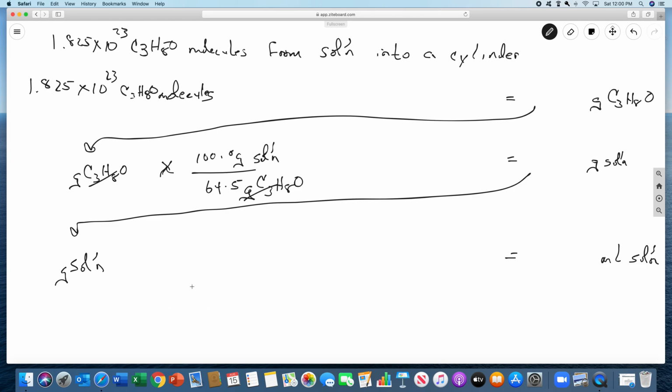You weigh it, right? You calculate this, then we'll actually put some in a cylinder and we'll weigh it. And we'll give you the number of what the cylinder with the solution weighed, and you can find the mass of the solution and compare it to this. But these are the calculations that you're going to do. And it's tricky, but during the Zoom session on the day we're doing this experiment, I can help you with it some more. All right?